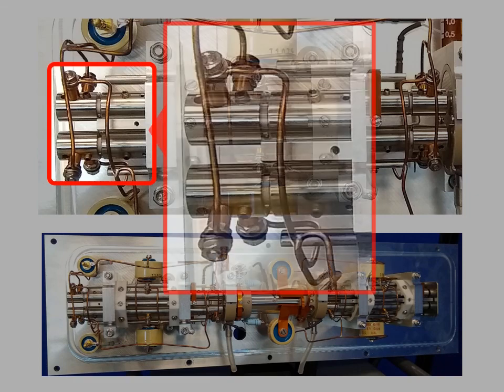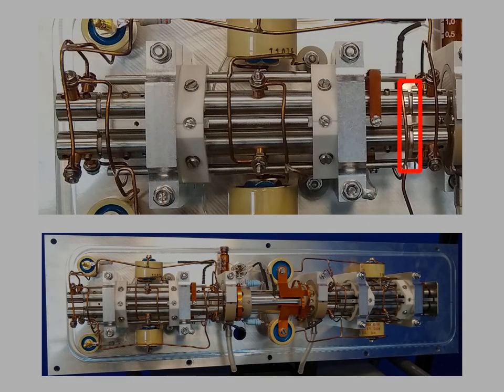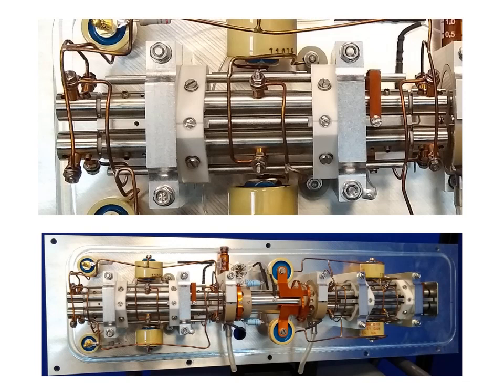Hopefully you can see what appears to be a small break in the quadrupole rods just after the inlet. And there's a similar break at the exit end of the quadrupole, where again there's a small set of quadrupole rods just beyond the break. So in this section we're going to look at why quadrupoles are often designed this way.